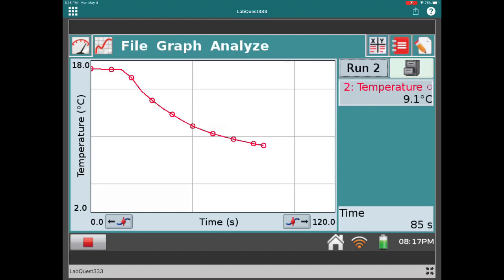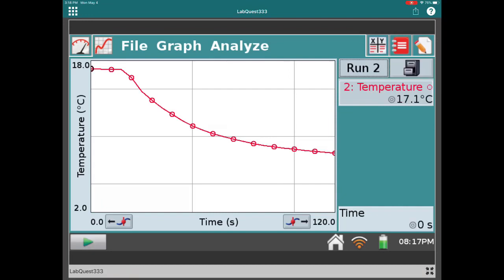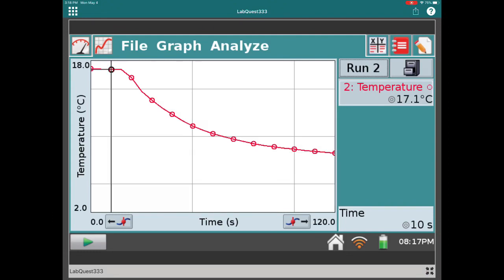You can tell from the shapes of these cooling curves that they're very smooth curves — there must be a nice mathematical relationship describing the temperature-time connection. If you're interested, you can look up Newton's law of cooling. At 120 seconds we'll stop collecting data. We'll click on the final point to record the final temperature — the lowest temperature reached — and then the starting temperature before it evaporated, and you can find delta T for acetone.